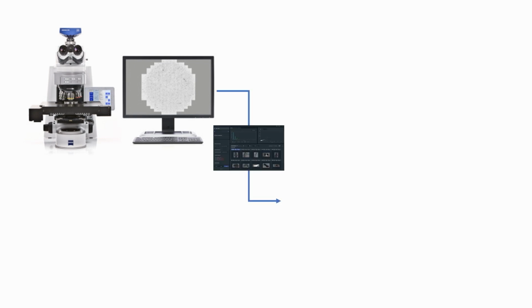Now let's talk a little bit about the multimodal microscopy. What if you need to do some in-depth analysis once you've looked at your component or your sample with an optical microscope? Well, normally it would take quite a long time to relocate particular fields of view or particular regions of interest on a scanning electron microscope because the magnifications are so high and the resolution is so high. What we can do here is make it a lot easier for you.